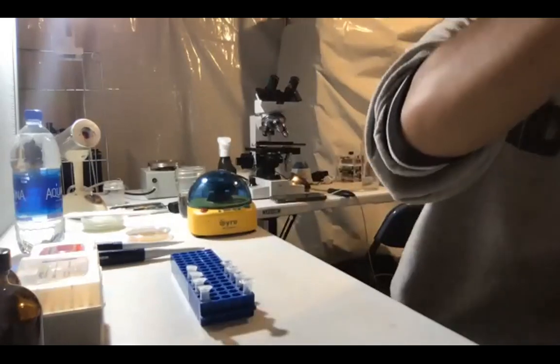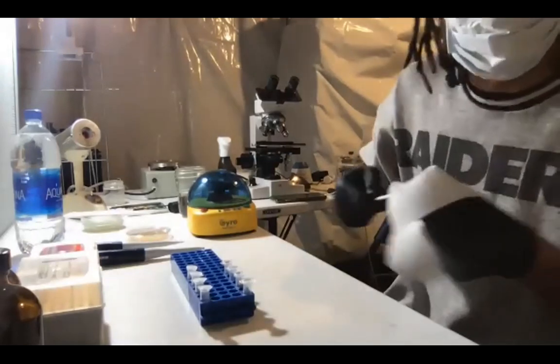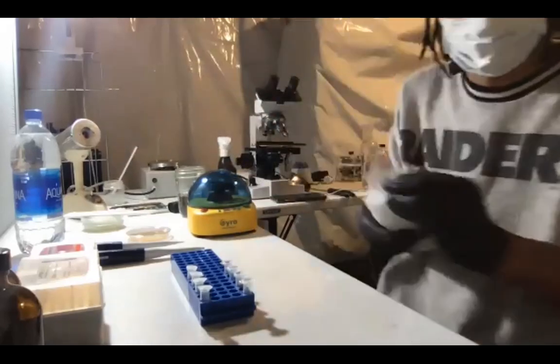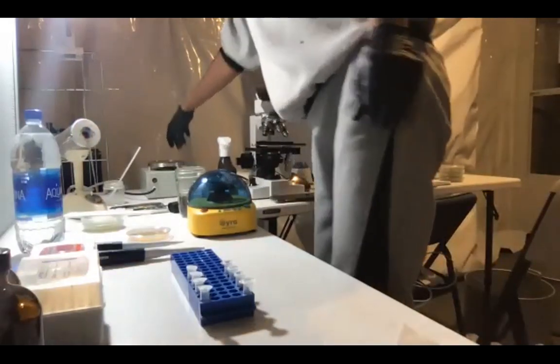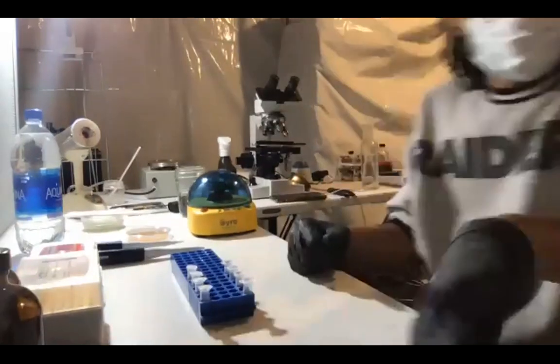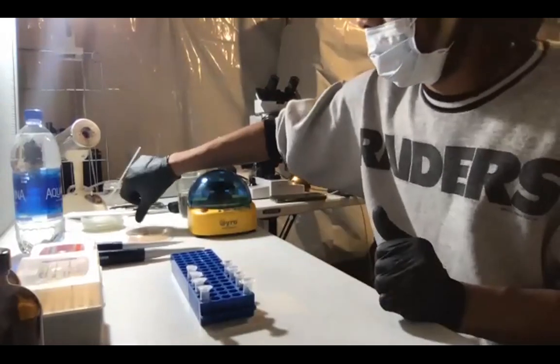And then I just take a paper towel and wipe off the tips of my pestle and then put it back into a bleach solution to kill off the DNA from it so I can use it again later. I'm going to go ahead and get this hot really quickly. I don't have one tool that I really would like to have, which is a heat block.